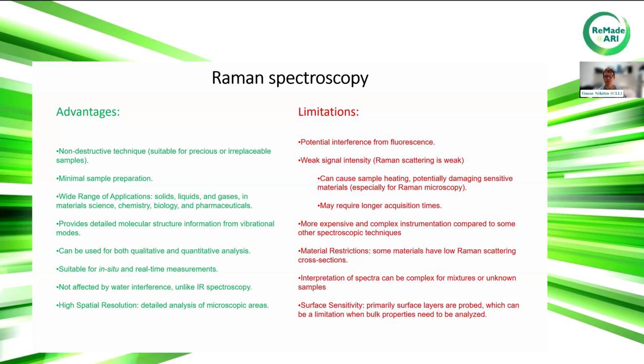Then, of course, not all materials will be active in Raman scattering. And then also interpretation of spectra can sometimes be complex if samples are unknown or we have some complicated mixtures. And then maybe the last one is the surface sensitivity. Since we are working with this design of the method, we are basically probing the surface of the samples.